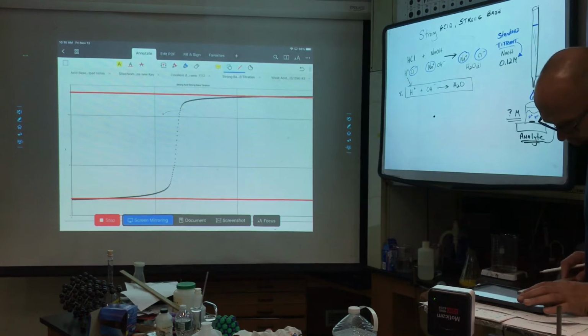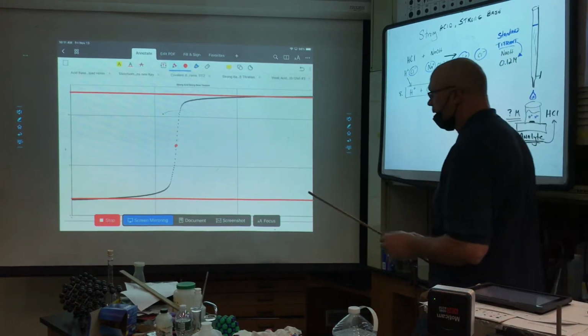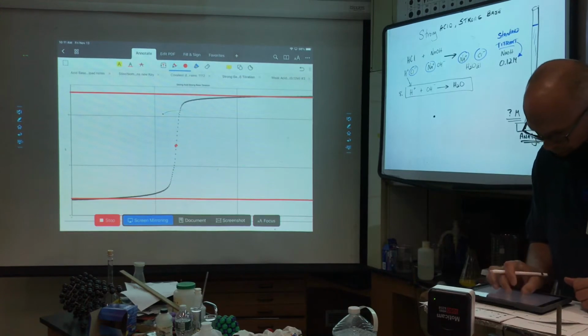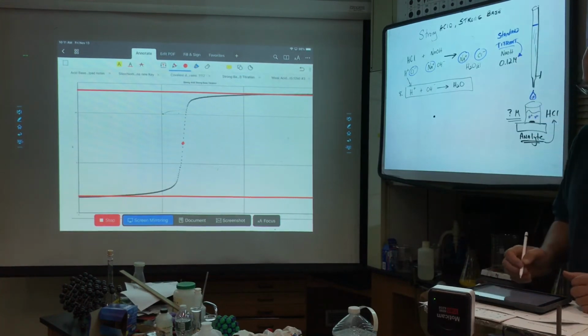Okay. And for me, when I do it on the iPad, I get 8 centimeters on the iPad. And I can get a 4 about right here. Okay, so for me, there's my dot. That's my midpoint between those horizontal lines there.